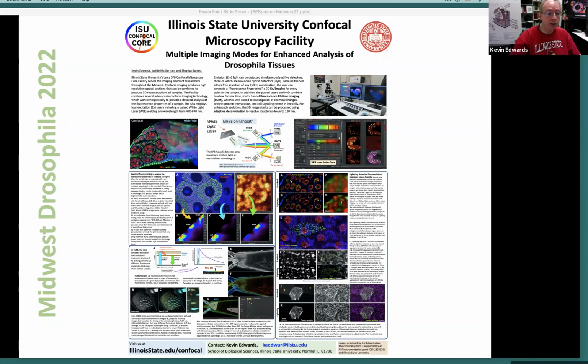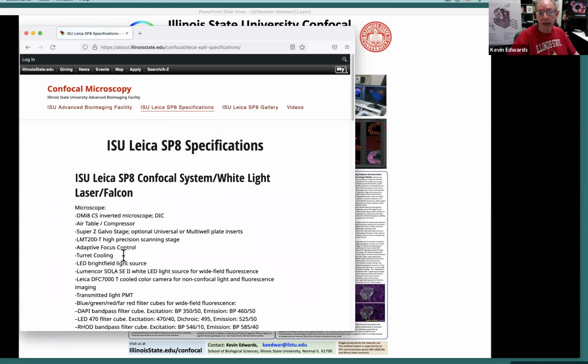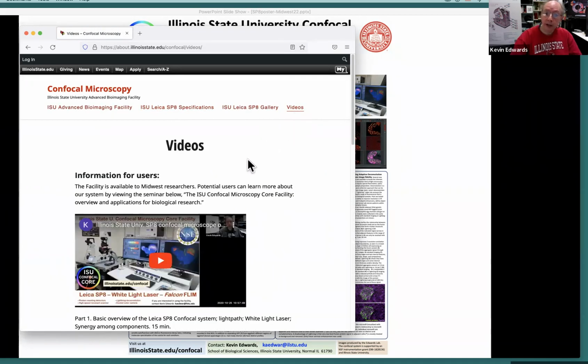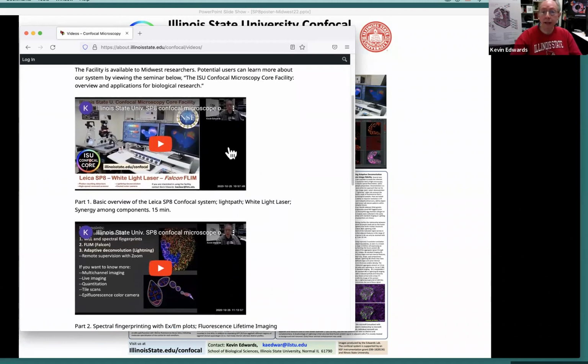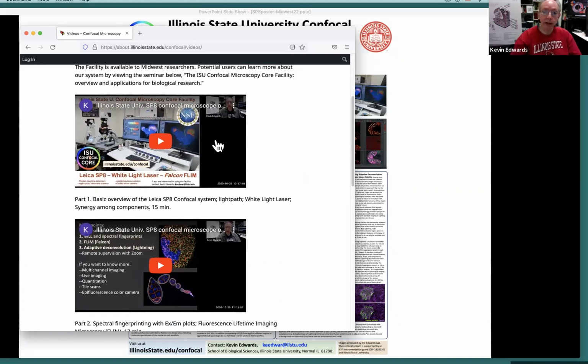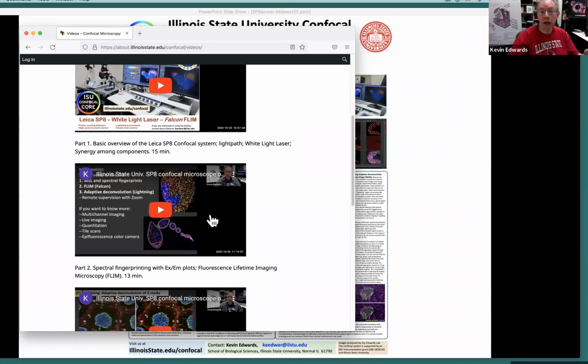Now, if you would just like to learn some more about the scope, you can check out our facility website here. Here you'll find the specifications for the system. Here you can find some videos on the facility that I posted to YouTube. I won't try and duplicate this information here today because you can find it here. But there's an overview of the facility and some of the background information on the imaging modes that we'll talk about today. Instead, today I want to show you some updated examples of how these different applications can be used for various research questions.